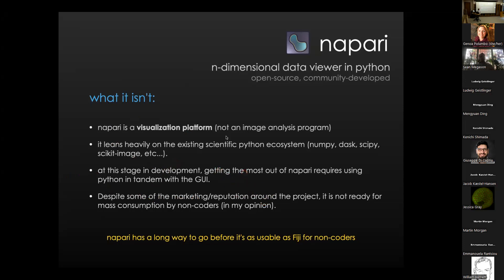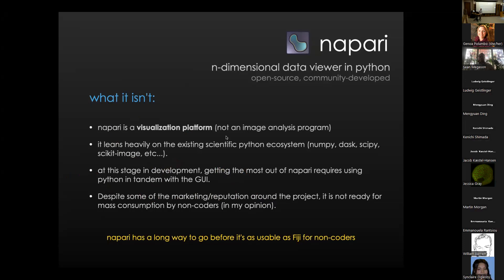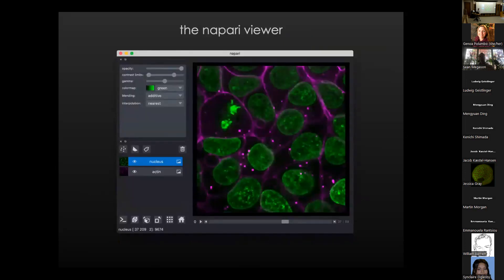Getting the most out of Napari at this stage does require using Python in tandem with the GUI. One will get much more out of it if they're able to get their hands dirty a little bit in the code, and they'll be frustrated if they can't. Despite some of the marketing around the project, it's not ready for mass consumption by non-coders in my opinion, and it's got a long way to go before it's sort of Fiji, but just for Python. Let me give you a quick tour of what it looks like and the principal components.